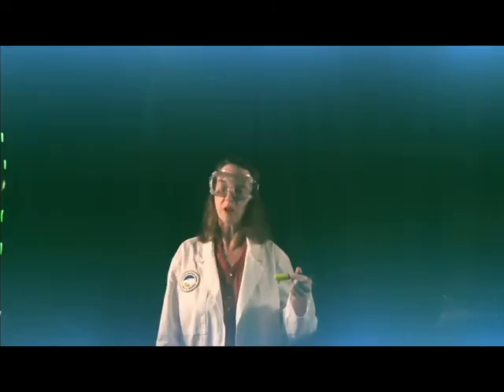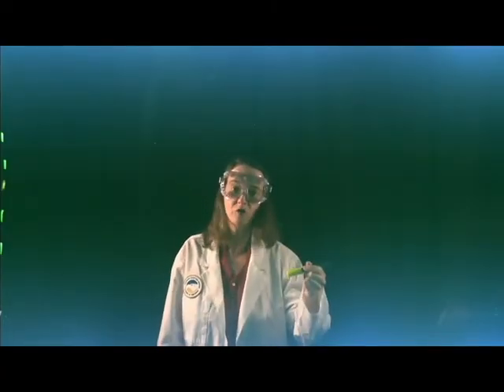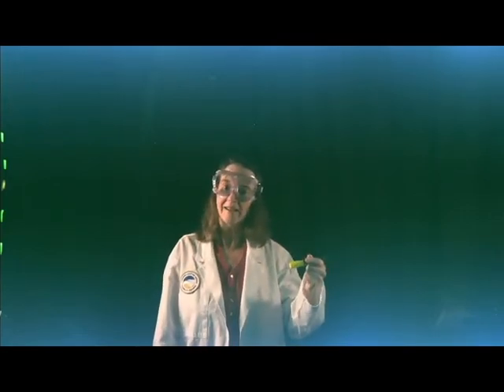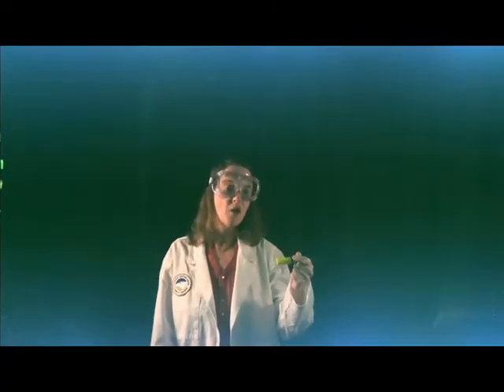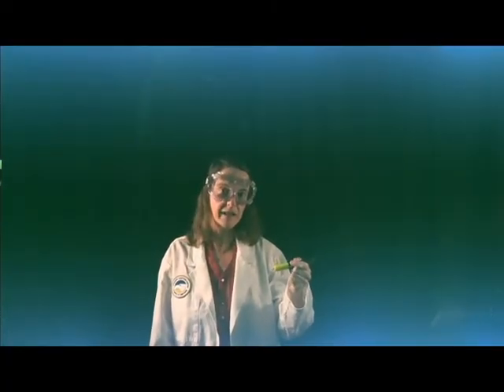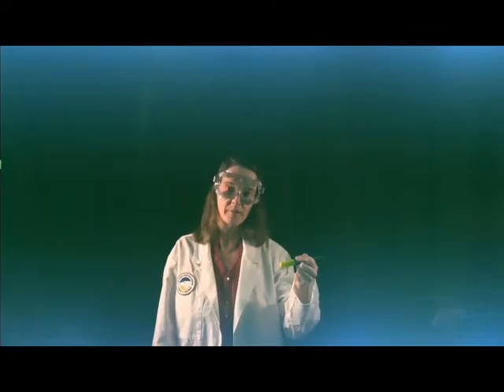We're going to have two atomic absorption spectrometers set up. One of them will be ready for you to analyze for calcium, and the other one will be ready for you to analyze for magnesium. What will you do? You will be analyzing standard solutions, which are solutions that have known concentrations of magnesium and calcium, and then you will prepare a tap water sample and run that sample through both the calcium and the magnesium spectrometers.